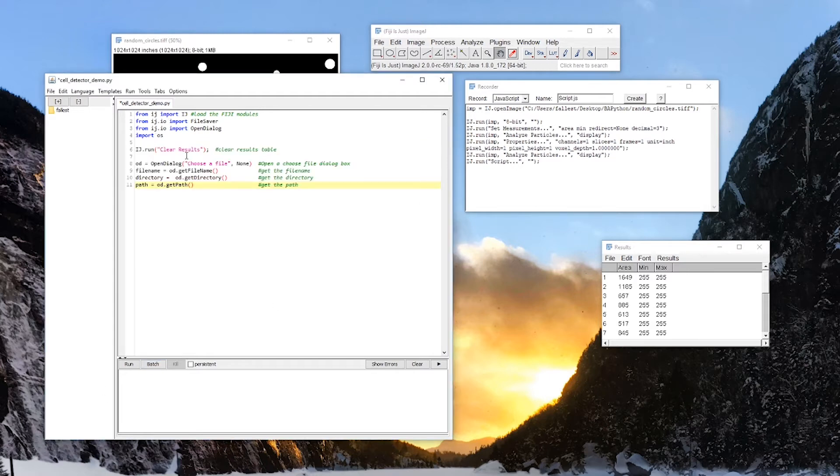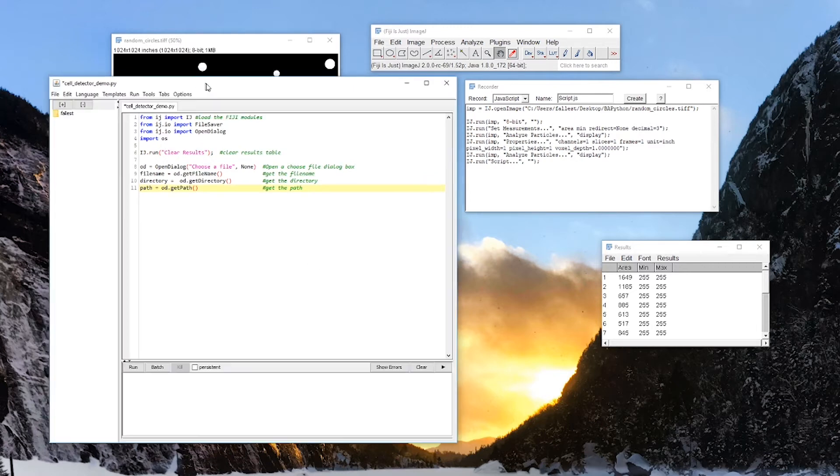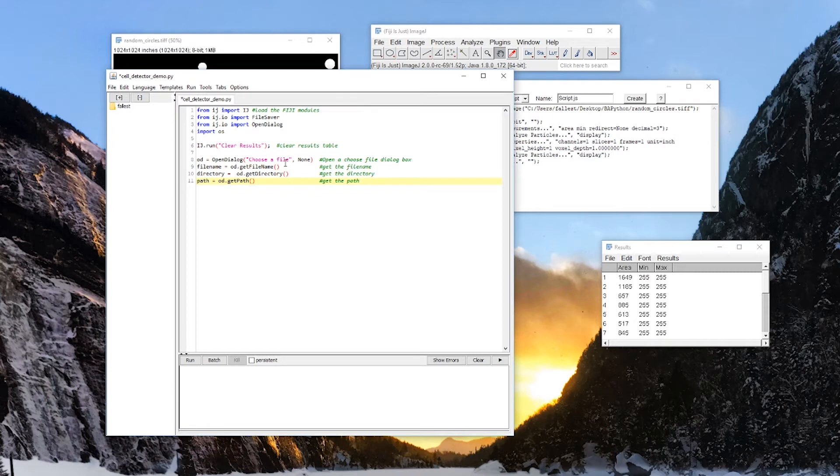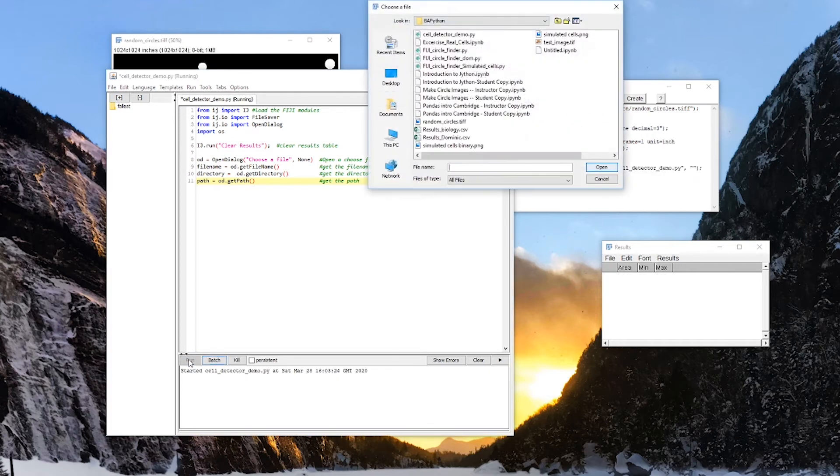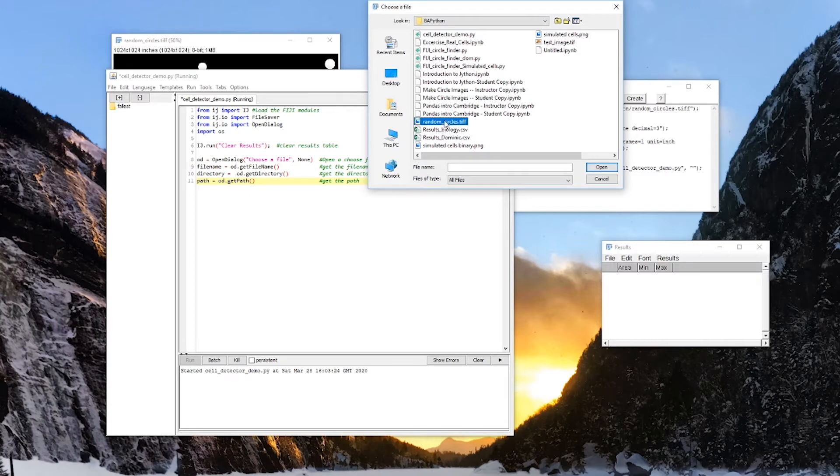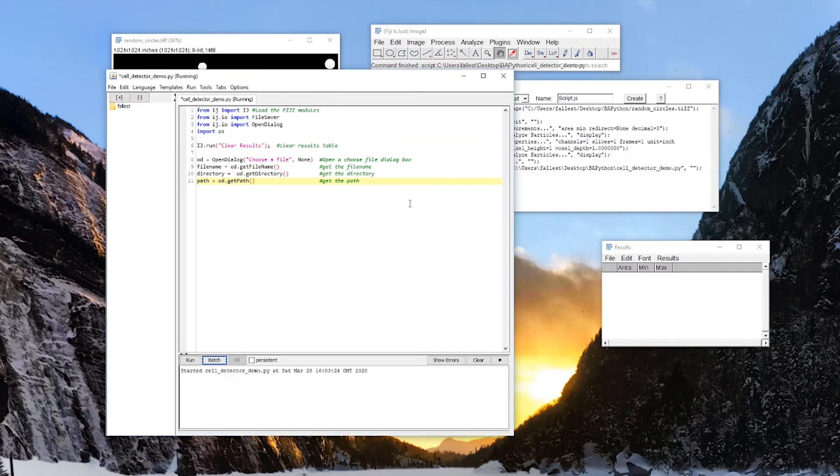So IJ.run clear results. This just clears the results table, so that at the beginning of every operation, the results table is cleared out. OD is open dialog. And then we're going to just write in here, choose a file name. I can write anything in here. I can say, please choose the file, choose a file, or whatever you want to put in that title bar. And then this is going to be file name. It's just OD, get file name. That gets the file name. OD.get directory gets the directory, and OD.get path gets the whole path. So if I run that now, what's going to happen? You see the results cleared, and I get a dialog box that I can choose a file from. And that is all that happens.